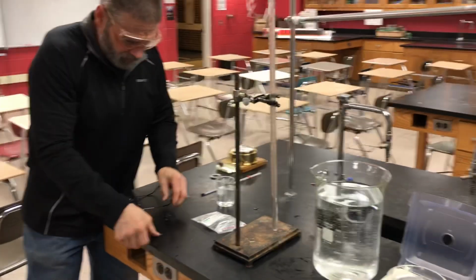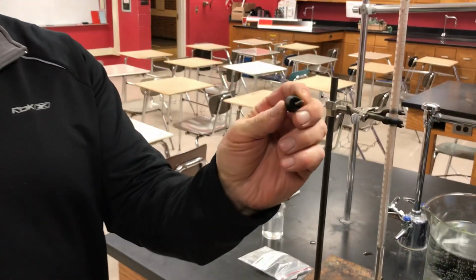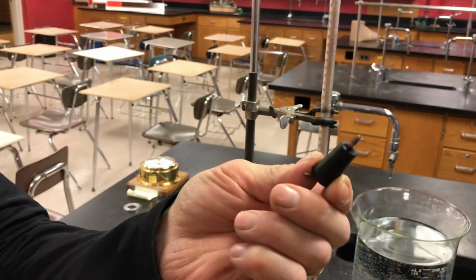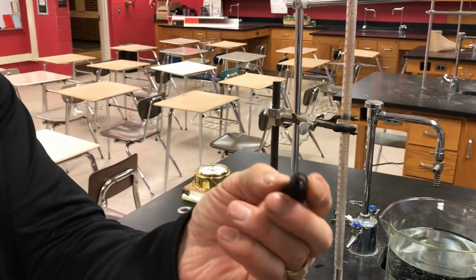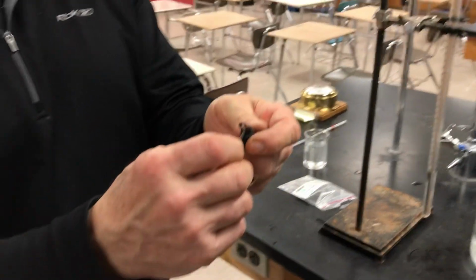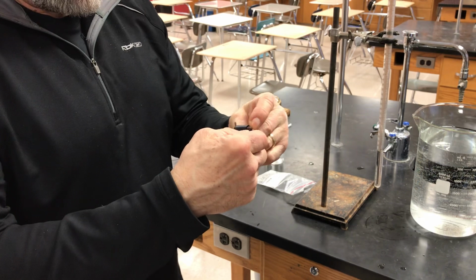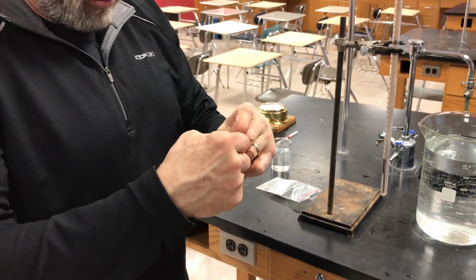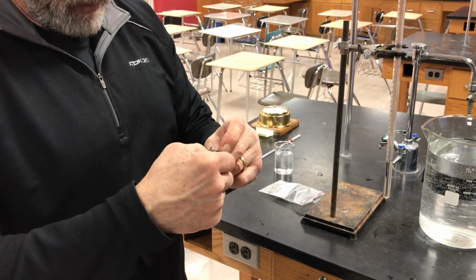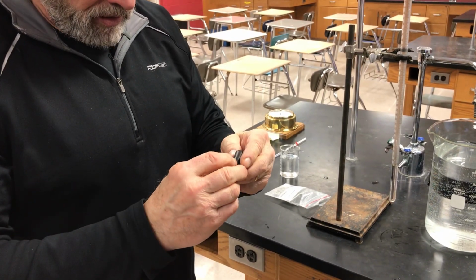And I'm also going to rig up the magnesium. So we have a stopper here that has a hole through it. It's a one-hole stopper. There's a piece of copper wire that we stuck through there, and its job is simply to hold this piece of magnesium in place. We want it to remain at the bottom of the tube once we flip this thing over. So I'm trying to get this wedged in here so it won't move.